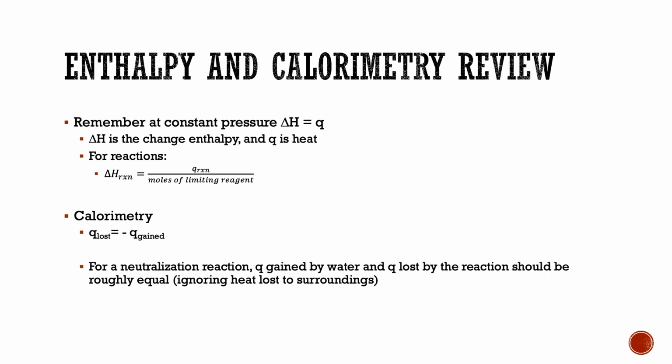Now, for this week's lab, we are going to do one thing that's actually a little bit easier than the 1211 lab. In the 1211 lab, we talked about calorimeter constants, and we calculated a calorimeter constant for this particular experiment and used it to look at the enthalpy of neutralization of a reaction. Well, now that we've put you through that process, those calorimeter constants are small enough in this case that we can, for the most part, get away with ignoring them. So we are just going to ignore the calorimeter constants or the heat loss to the surroundings in these cases. They should be close enough to the real results that we'd expect for us to be able to see all the patterns that we should be able to see.